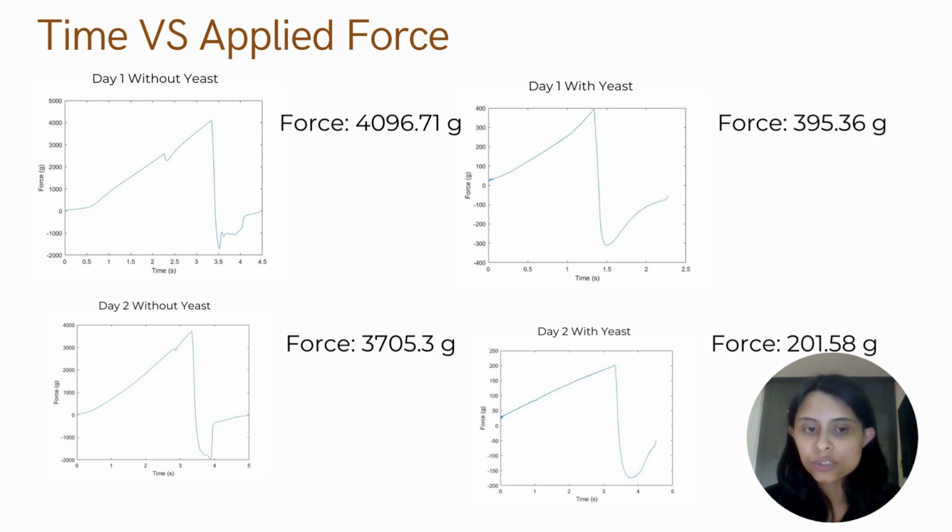This same behavior is observed in the yeast dough, as over time the dough will have a decrease in the resistance strength. With respect to the dough without yeast, it is observed that it has a greater average strength compared to the dough with the yeast.